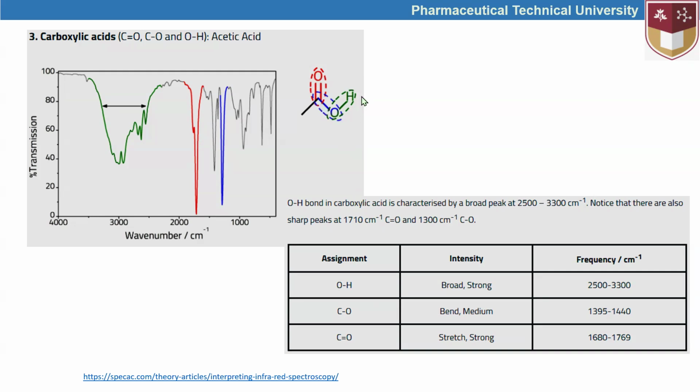So these three different colors belong to three different bonds: the carbon-oxygen double bond, the carbon-oxygen single bond, and the oxygen-hydrogen single bond.